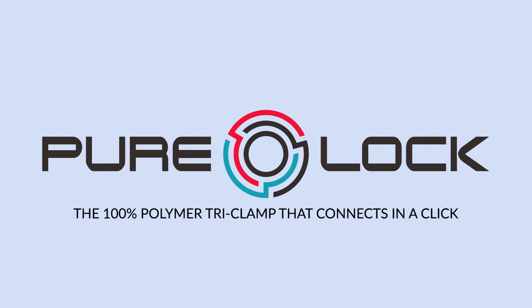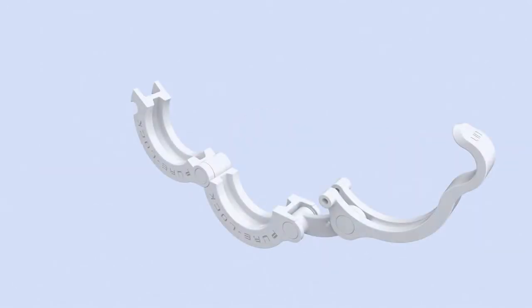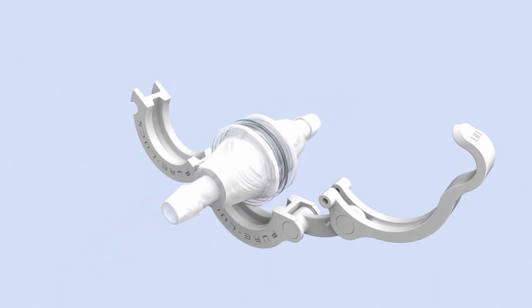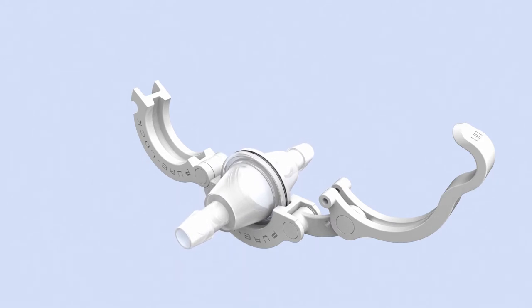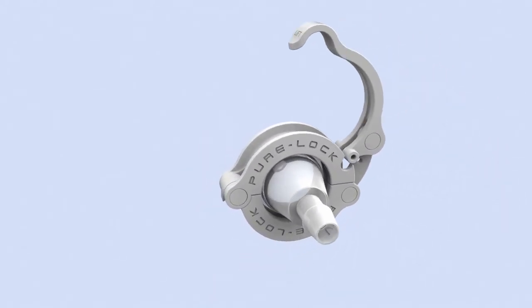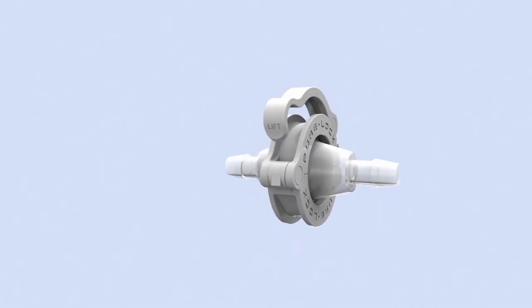Introducing PureLock, the 100% polymer tri-clamp that connects in a click. Quick and easy assembly and compatible with all sizes of sanitary tri-clamp connectors. A unique design with an over-center cam arm locking action and a click-to-lock fit.